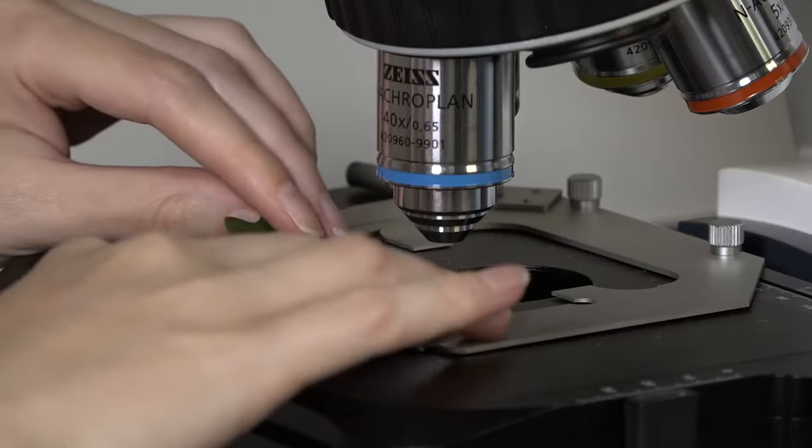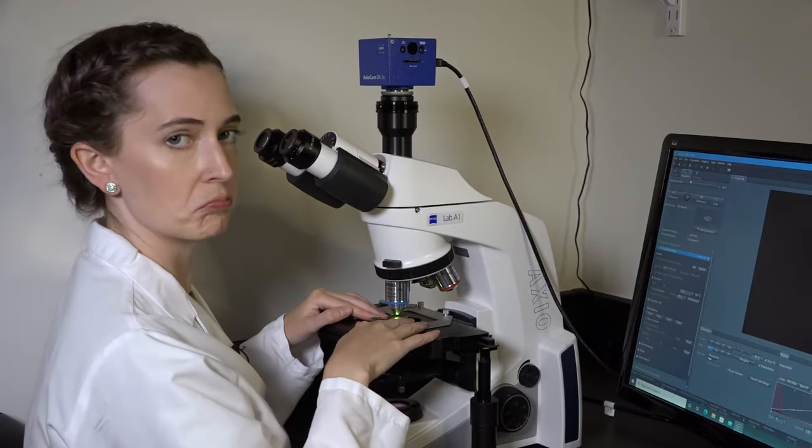In this video, we'll be doing a stomata peel, which is a technique for visualizing all of these teeny tiny mouths. We can't see them if we just stick a leaf under a microscope. We have to do a few extra steps.